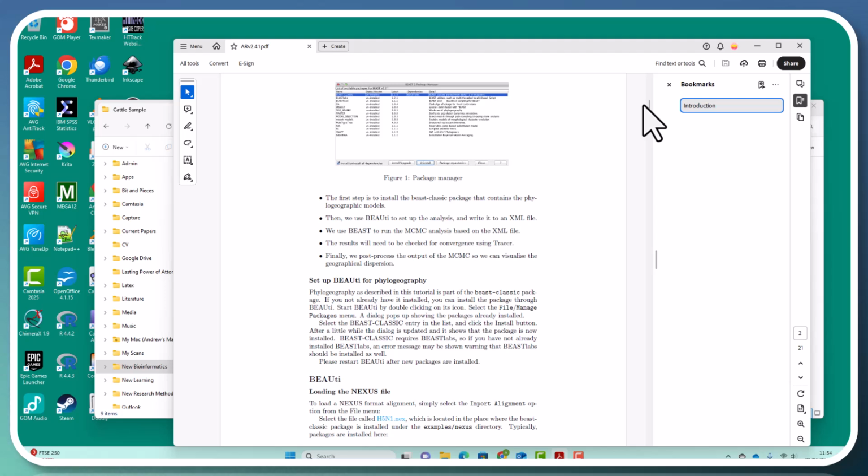When you do the alignment, you still need to do some editing to make sure that you haven't got sequences with missing nucleotides, so large numbers of Ns. And in this case, because we also need the geographic data, you need to remove any sequences that do not contain geographic data about the state they were located in. Any sequence that just says yes, this comes from the US isn't useful, because we need the exact location regarding the state to be able to use it in this particular analysis.